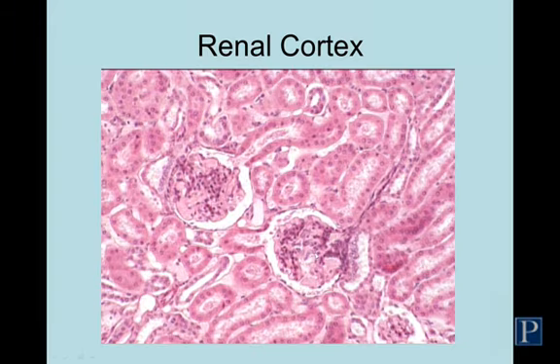the glomerulus here, which is surrounded by two layers of connective tissue capsule. The outermost layer of the capsule is called the parietal layer, and it's made of a simple squamous epithelium, as you learned early on. The innermost layer, called the visceral layer, which makes direct contact with the endothelium of the glomerulus, is composed of specialized cells called podocytes. You can read more details of the morphology and function of podocytes in your basic histology text. We also have a model in lab that shows their structures.